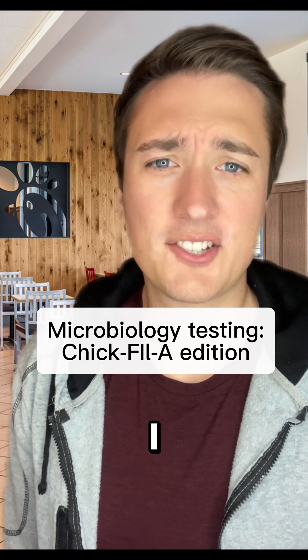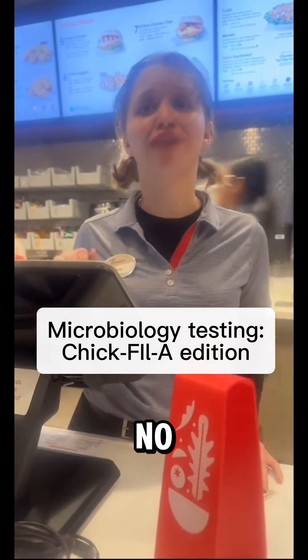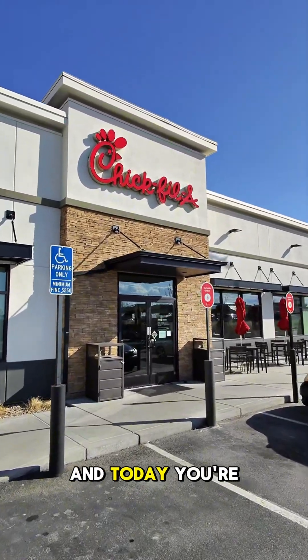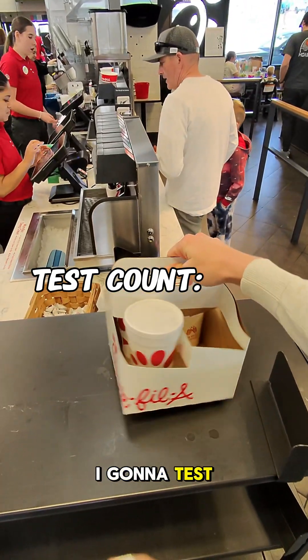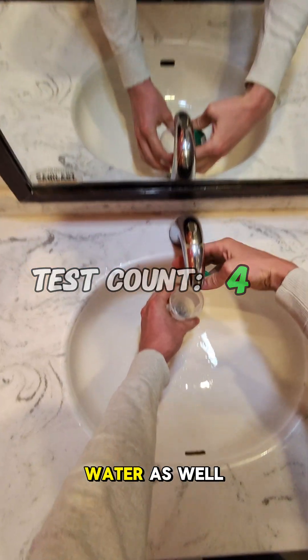At Chick-fil-A, I ordered a cup of water and a cup of ice. A viewer recommended I test the water here, and today you're in for a treat — not only am I going to test their water and ice, but I'm also going to test their lemonade, bathroom, and tap water as well.